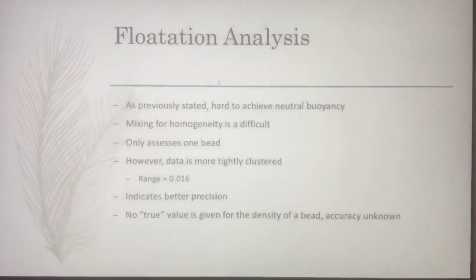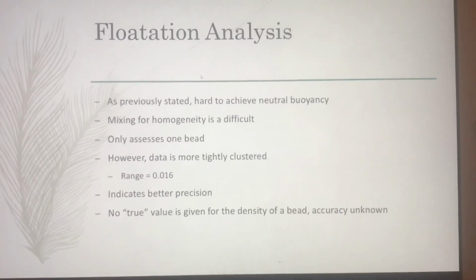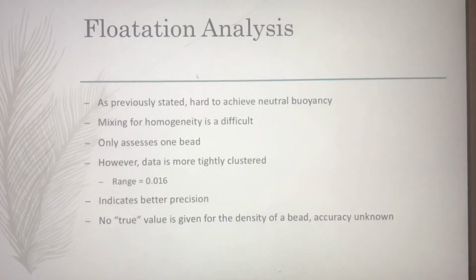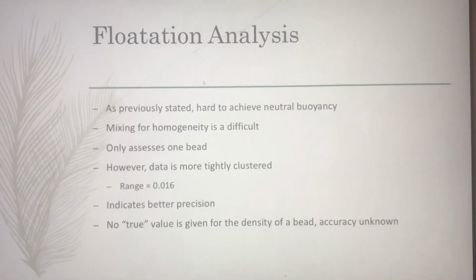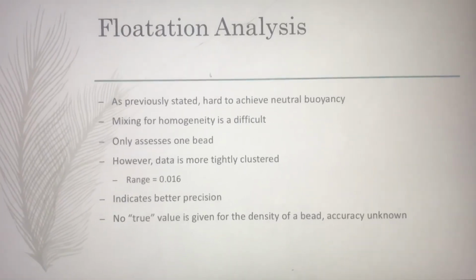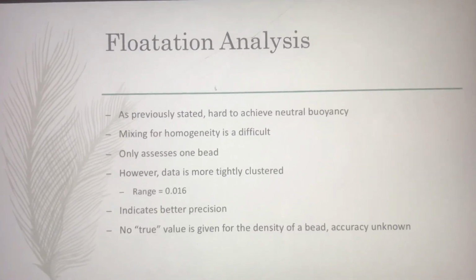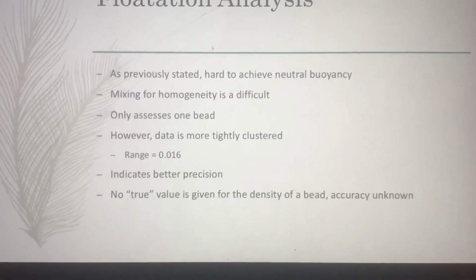All right, now on to the analysis for the flotation. As previously stated, it was a pain to achieve that neutral buoyancy, and a very small addition one way or the other could change it pretty wildly. I also had trouble mixing for homogeneity. The glycerin and the water didn't go together very well, and reaching down in that long graduated cylinder with that rod, it was hard to scrape all that viscous glycerin up from the bottom. So I had trouble making sure it was really homogeneous.